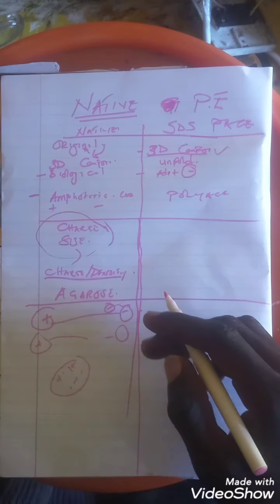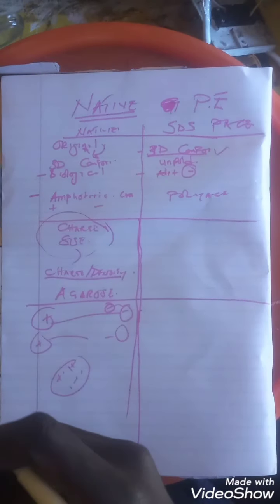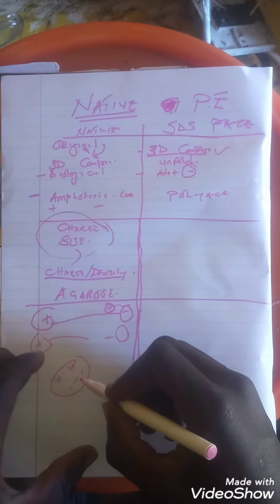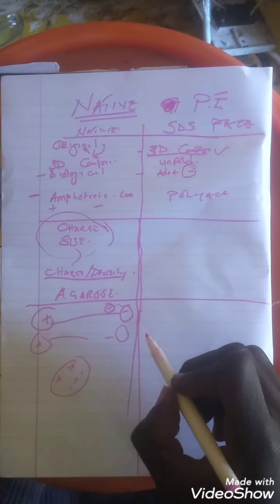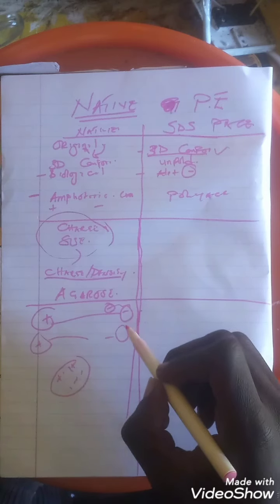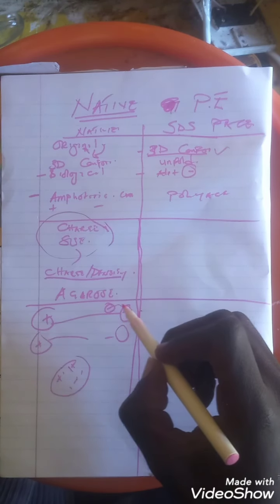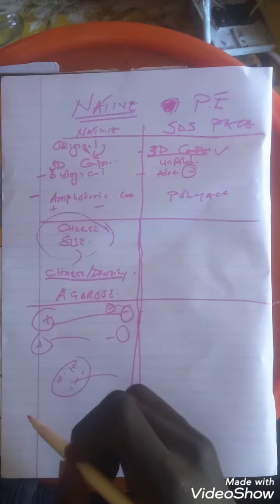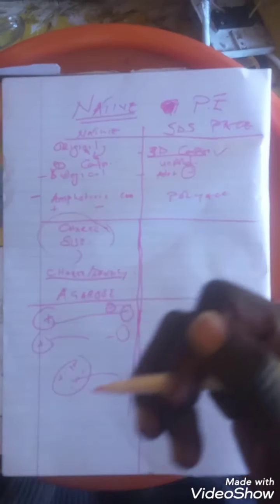So when an electric field is applied to that electrophoretic buffer, the partial cloud which has positive charges will start migrating to the negative electrode, and hence if it encounters any slow moving protein molecules, regardless of the charge that they have, they will be dragged to the negative electrode together with that partial cloud.